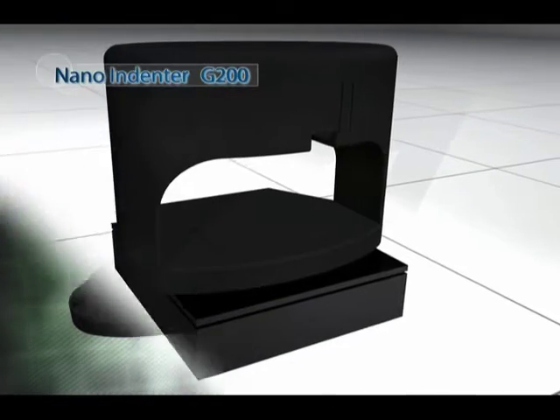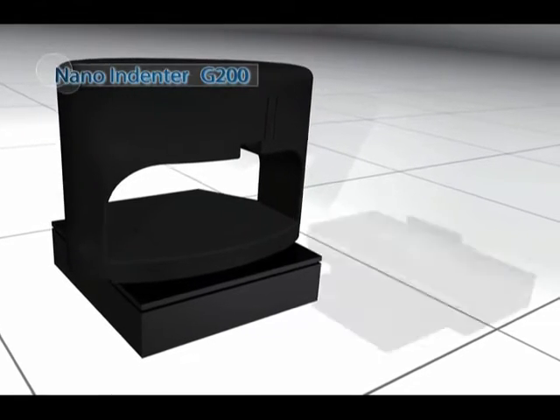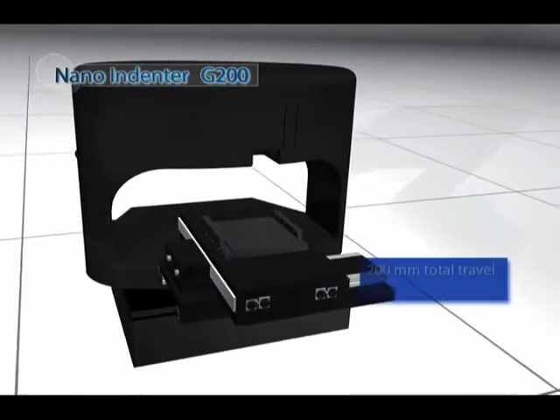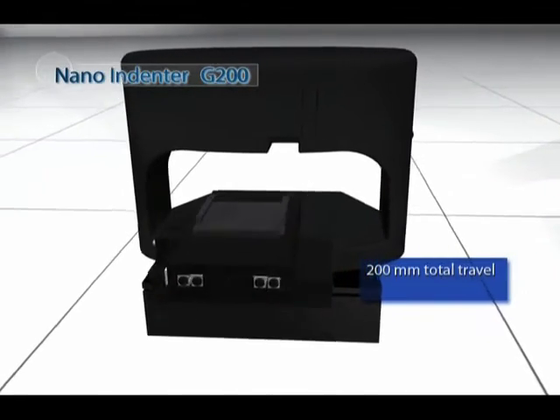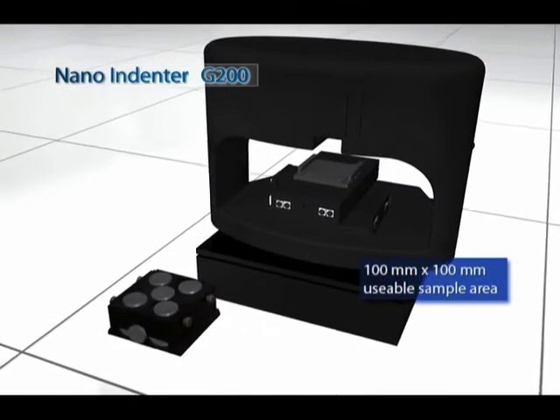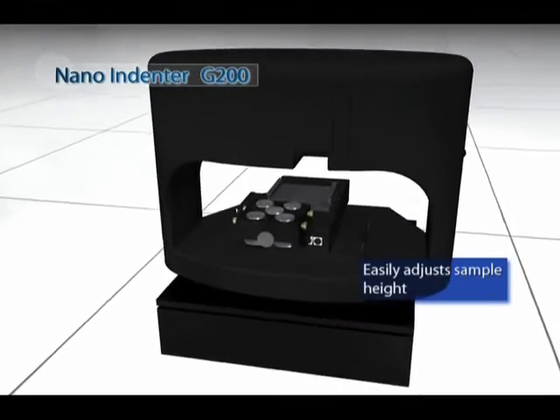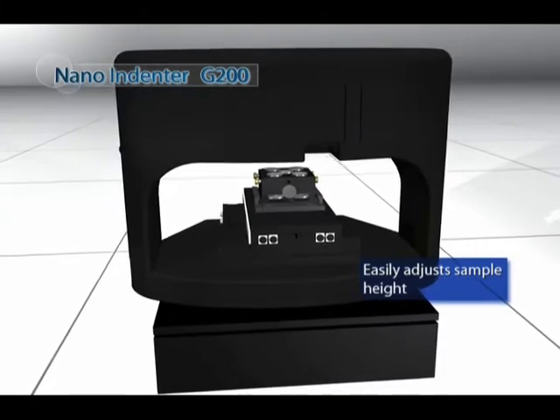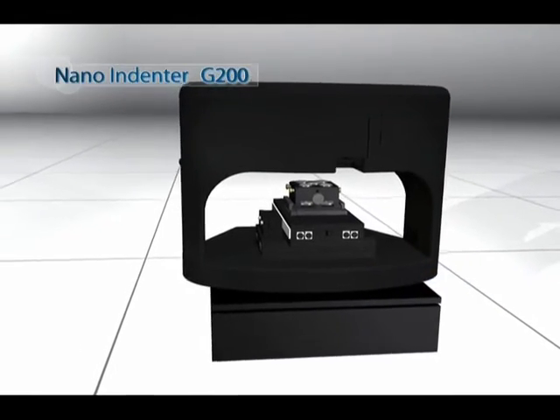These components are located in the system's gantry to allow for maximum sample coverage and flexibility in testing. Here, you're seeing how the XY motion system, sample tray, force transducer, and microscope assembly fit into the nano indenter gantry.